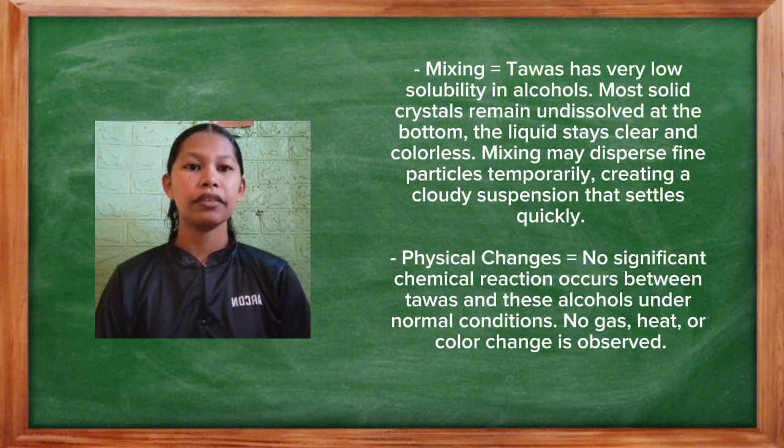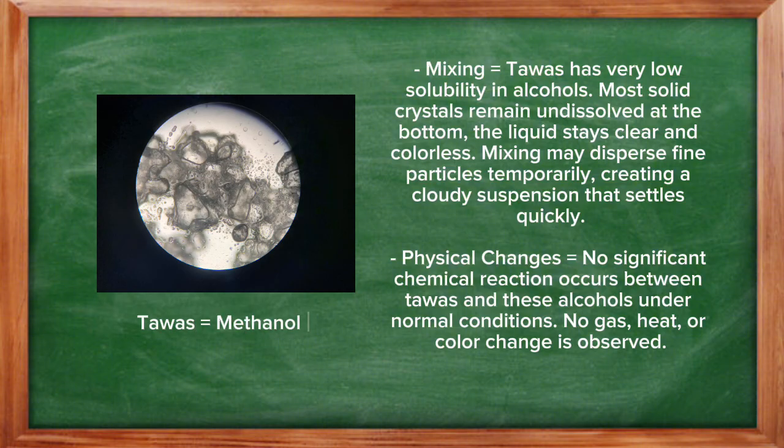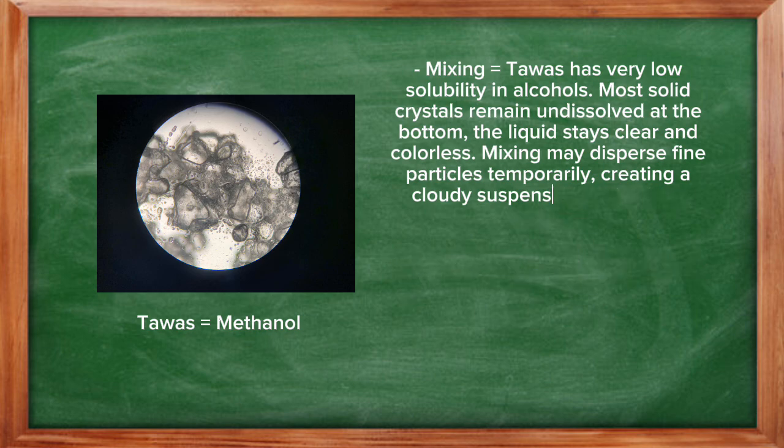Mixing may disperse fine particles temporarily, creating a cloudy suspension that settles quickly. Physical changes. No significant chemical reaction occurs between tawas and these alcohols under normal conditions. No gas, heat, or color change is observed.